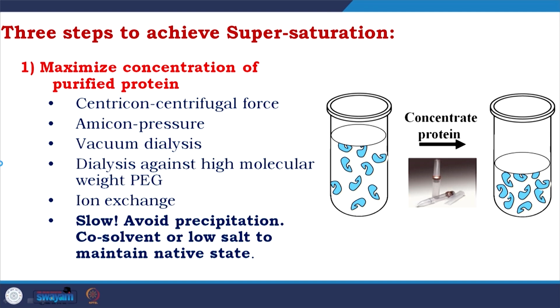What is this talking about? While you are concentrating the protein, you are taking out the small molecules. That is good, that is what we want, but there is a trick. If you lose more than enough small molecules, like sodium chloride or any other salts which are balancing the ionic concentration, or buffers, the molecules which are buffering, you have a high chance that your protein will precipitate.